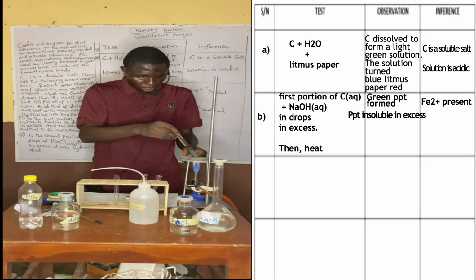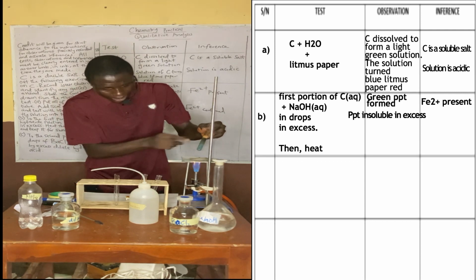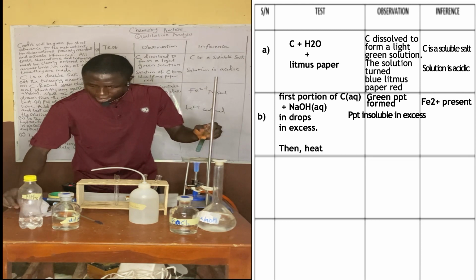We are trying now. Heat it and observe. You can see there is a gas, there is a shocking smell I'm perceiving here. There is a gas that evolves, so I will use litmus paper.